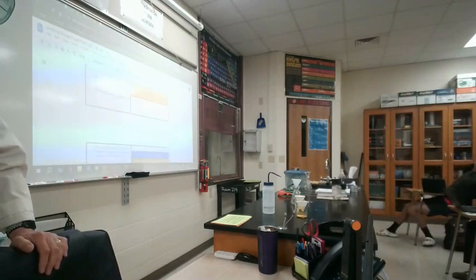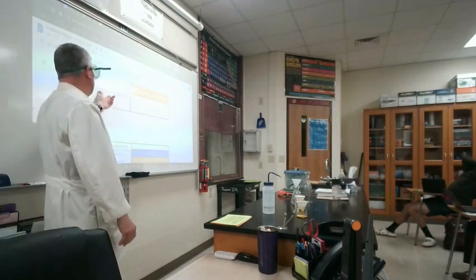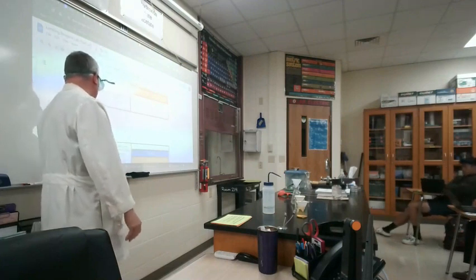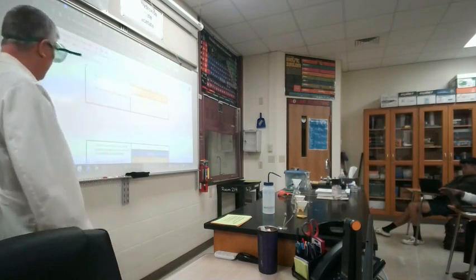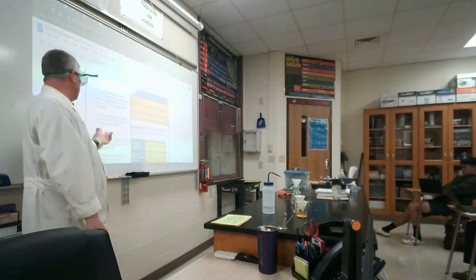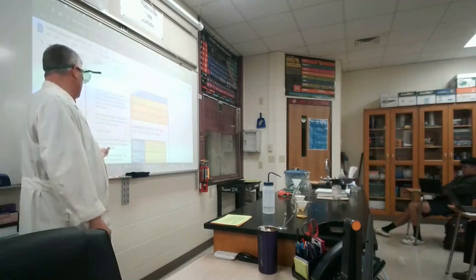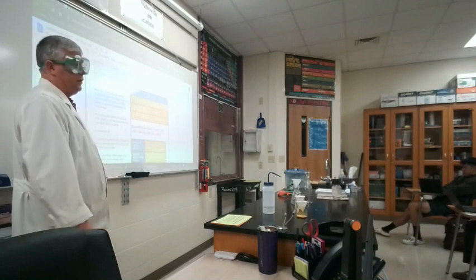Okay? So, wait a couple of minutes, allow the precipitate to settle. This would be a good time to record the observations in your lab. Set up the funnel with the filter paper so that it'll drain into an Erlenmeyer flask. After it is settled, you start to decant it a little bit at a time. Okay? Rinse it down, stir it, let it settle. Repeat steps 8 and 9 over and over again. Carefully remove the filter paper from the funnel, place it in the beaker with the precipitate, and we will put it in the drying oven overnight.